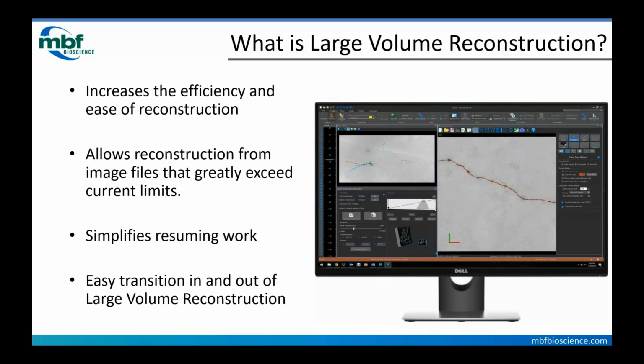So in this case, we're taking the entire image volume, and instead of having to swallow the whole thing at once by making your GPU display it at once, we're improving that process by allowing you to specify at what resolution you want to see how much of that data. And so that's what we're going to demonstrate right now.